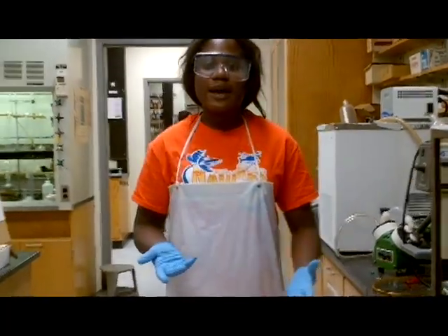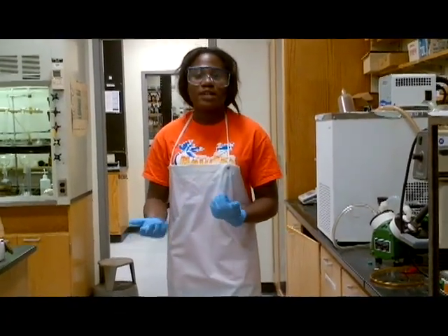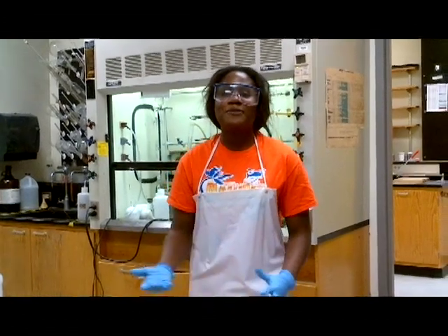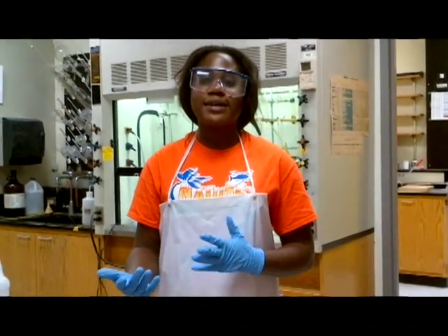Unfortunately, that was base, and bases and acids are known to react very violently and can lead to explosions in the lab. End of the lab safety video, and if you're done watching this, you should be prepared for your organic chemistry lab. We've seen a lot of mishaps that could happen today, one of which is fire.